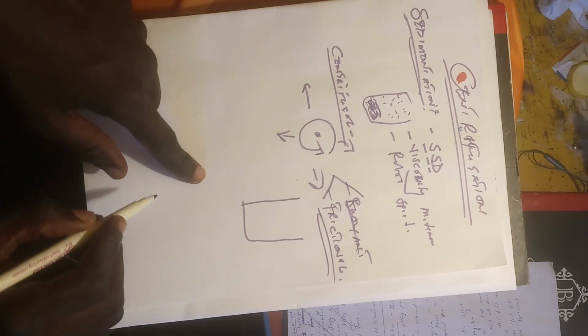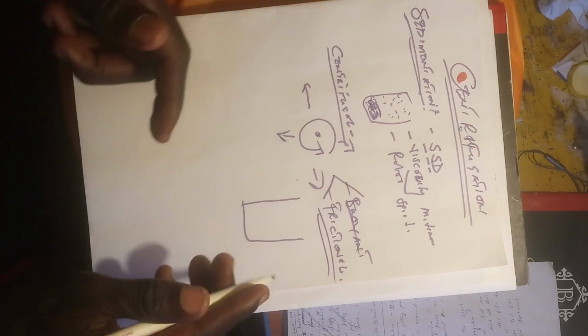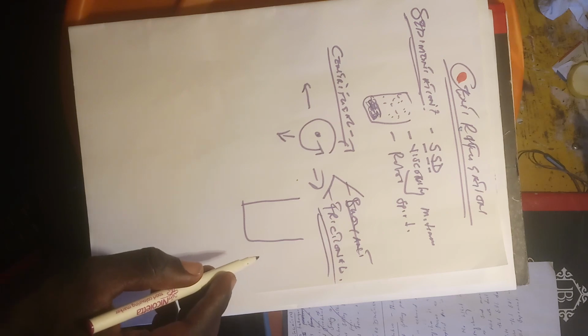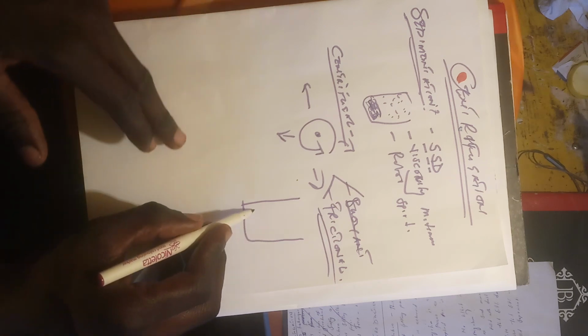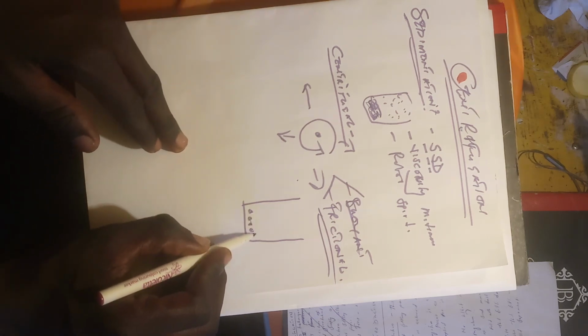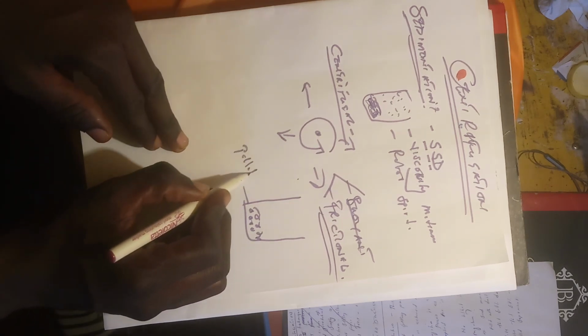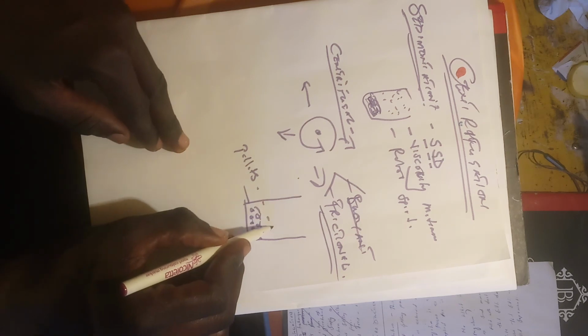Those particles which we define as the heavier phase, or the larger or denser ones, will settle at the bottom as pellets.